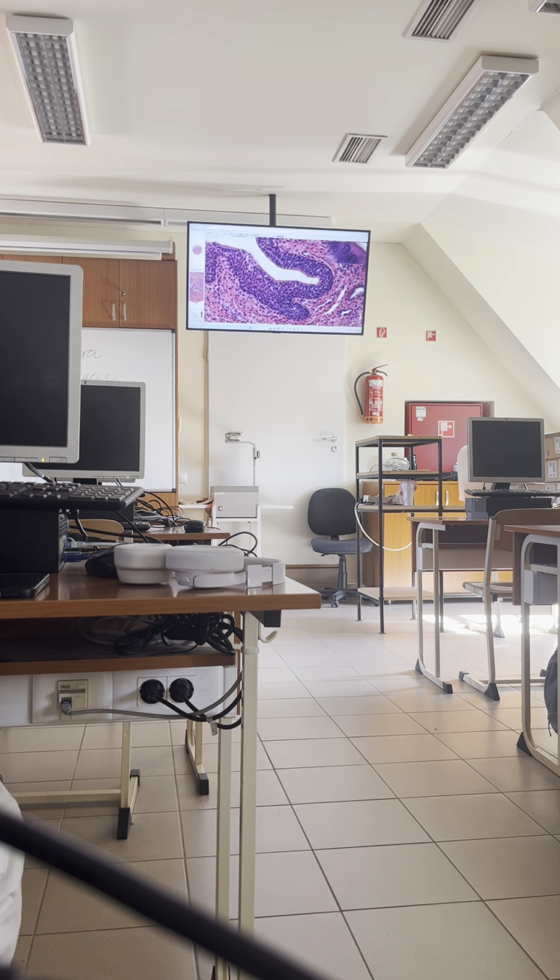And therefore we can conclude that because both types of epithelium are visible here, this is a kind of transition between the spongy part of the urethra and the navicular fossa. Navicular fossa is the most distal part of the male urethra, located in the distal part of the glans penis. That's a widened part.